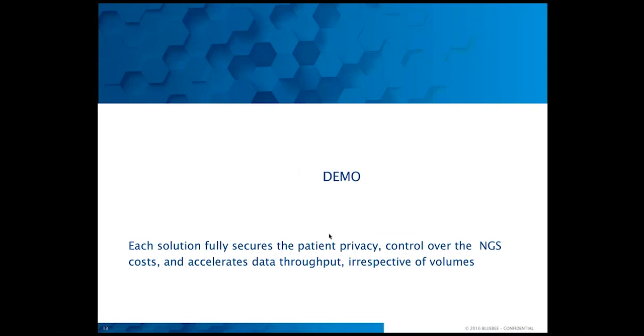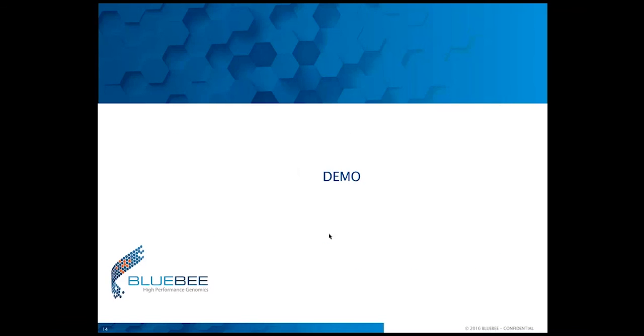So that's it from an introduction perspective. The idea is that we would go now to a demo so that I can show you how everything works on a day-to-day basis.